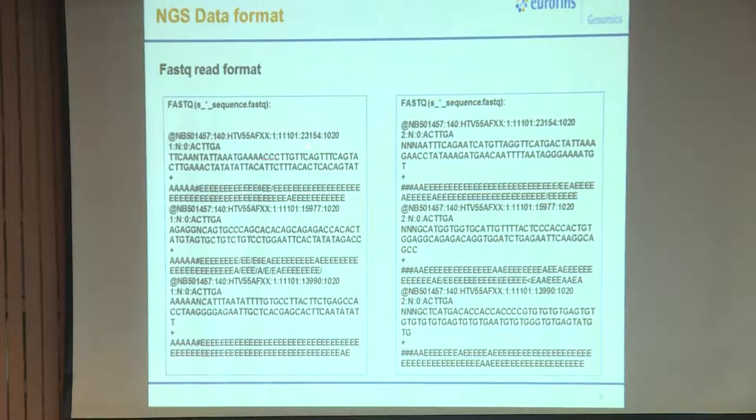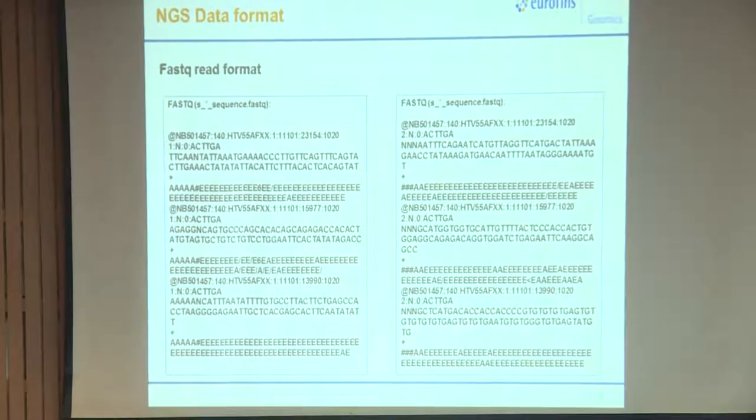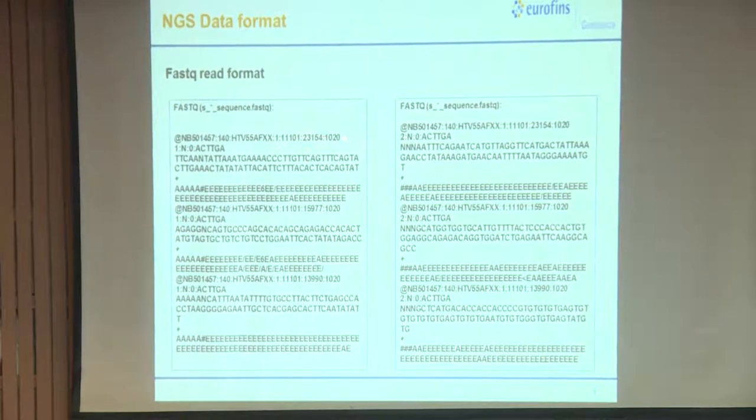The header of the read will have your instrument ID followed by the flow cell. When we are doing a sequencing, we have a flow cell which is barcoded, and in Illumina products that will be unique. So if a run fails, Illumina can detect which flow cell it is, which lot number it is, and whether that particular lot has gone off. That's the way you can trace your flow cell, followed by the tile number.